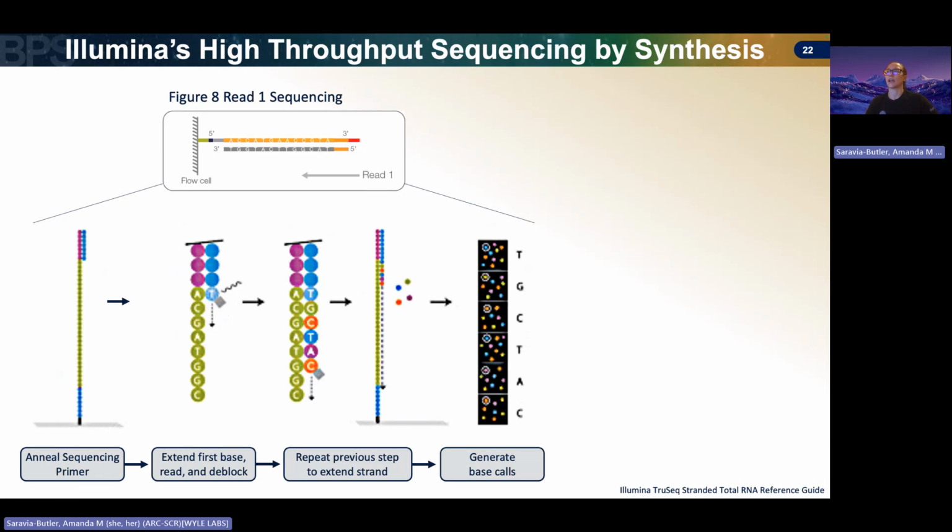And we're going to take a picture after each cycle so that for every single strand in every single cluster, we're going to be sequencing and taking pictures after each cycle, so that it's going to look like this. And then based on the color that is emitted, we will be able to know if there was an A, T, C, or G in that location of your unknown sequence. Once this first read is synthesized and we capture that sequence in these images, the next thing that happens is that synthesized strand is going to get washed away.